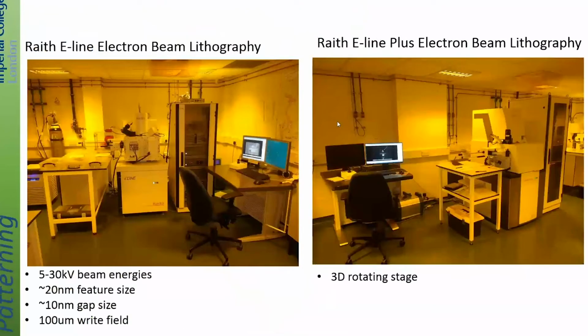So this is the first. We'll look at the Nano-Fabrication laboratory, and this is obviously a laboratory focused on fabricating plasmonic and nano antenna for our research there, and the main workhorses in there are two Raith eLine systems. One is in fact eventually going to head to materials, and so will be on the White City campus, but currently it's being housed inside our laboratory.